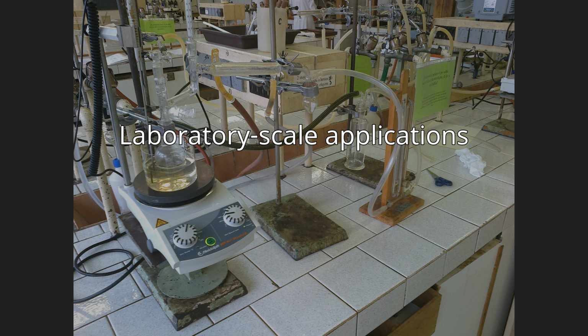Laboratory scale applications. Compounds with a boiling point lower than 150 deg C typically are distilled at ambient pressure. For samples with high boiling points, short-path distillation apparatus is commonly employed. This technique is amply illustrated in organic synthesis.